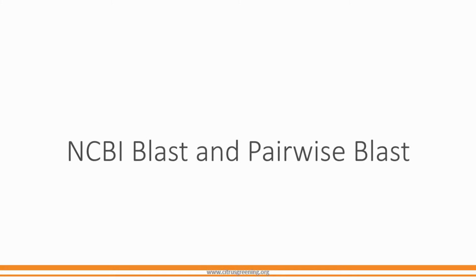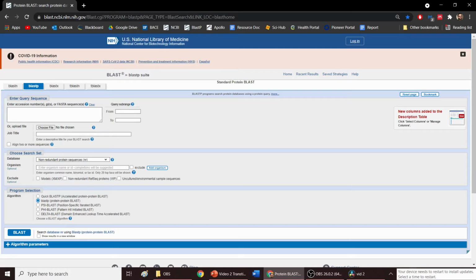Welcome to video 2 covering NCBI BLAST and Pairwise BLAST. In the last video, we went over navigating NCBI to find gene and protein pages for GAPDH and Drosophila melanogaster. In this video, we will cover utilizing the BLAST function for the same gene.